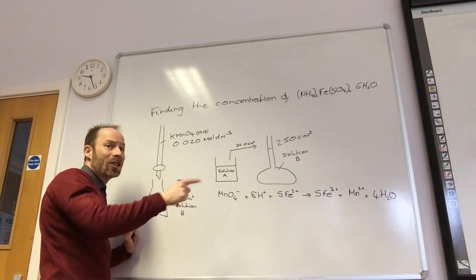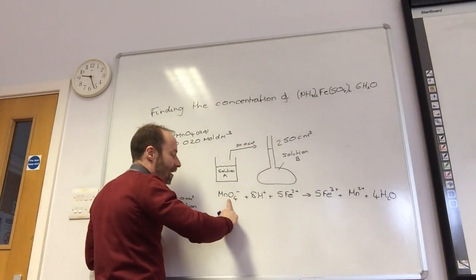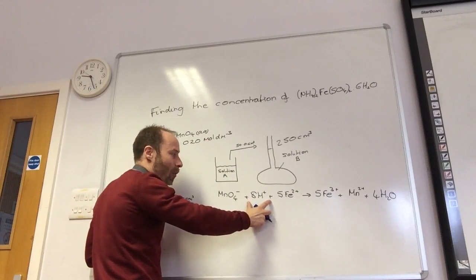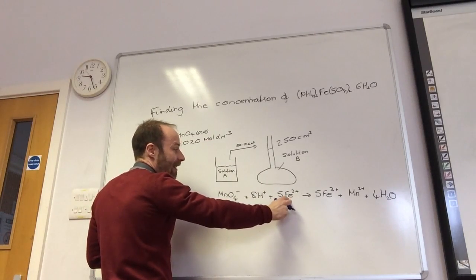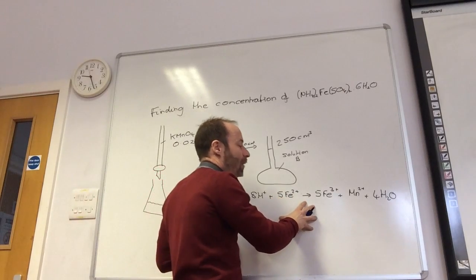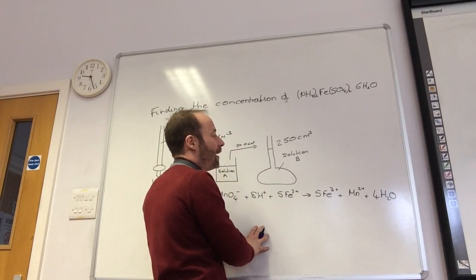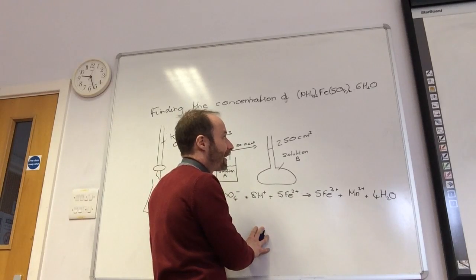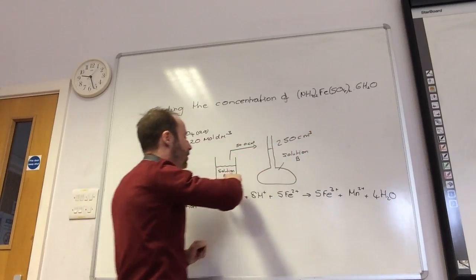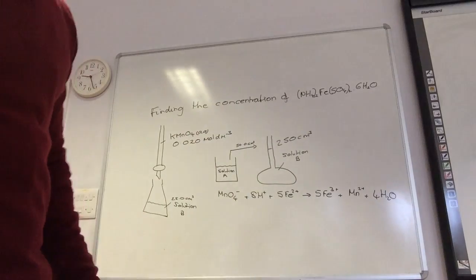I'm going to take that solution B and do a titration with it. So I'm going to be adding manganate ions. I'm going to add some acid in as well to just make sure it works. That is the iron that's in my solution B. And we'll get to the end point. That will give me a titre, and then we can run through the calculations to find the original concentration of solution A.